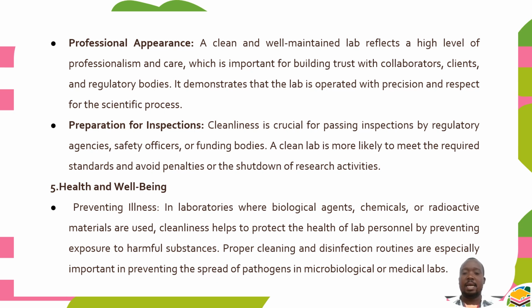Proper cleaning and disinfection routines are especially important in preventing the spread of pathogens in microbiological or medical labs. So yes, there's preventing illness.